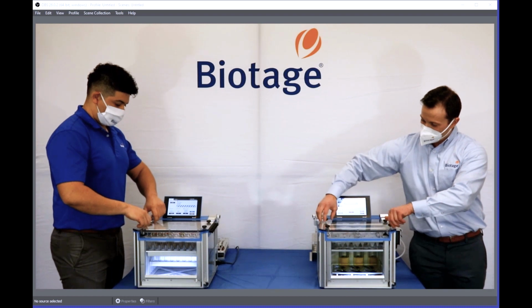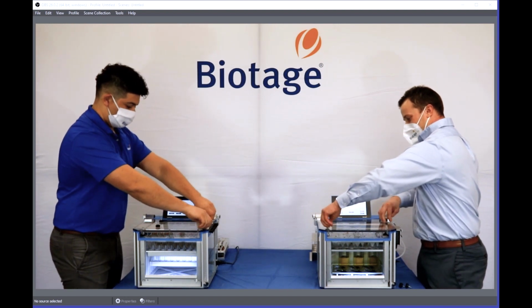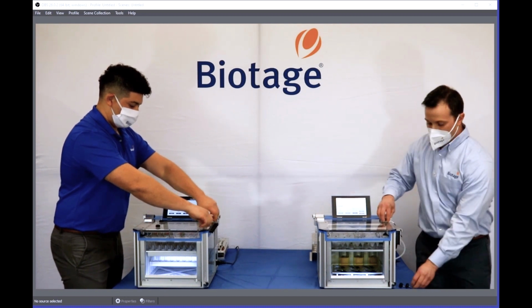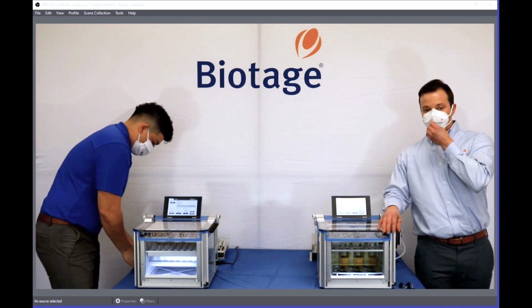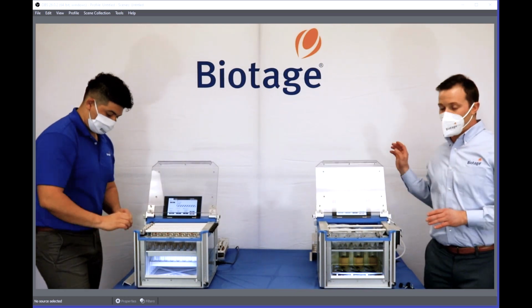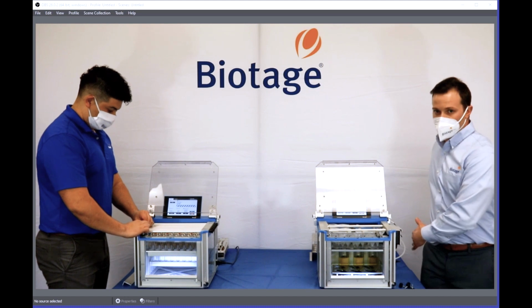While you do that, we've been asked, does the new unit have a quick disconnect adapter? Yes. And it has a gauge for the inflow. I always recommend it because many times labs will not think they're getting enough nitrogen, or something's going on internally with the system, but they're actually losing pressure from their source.